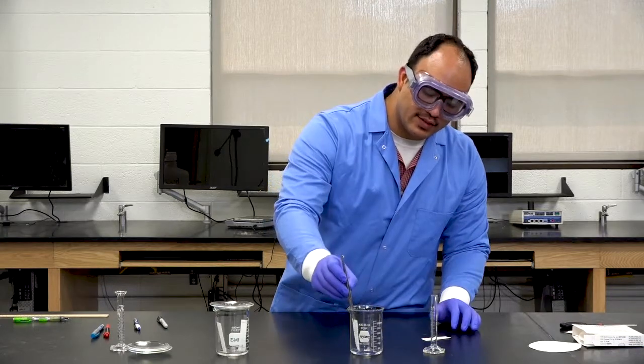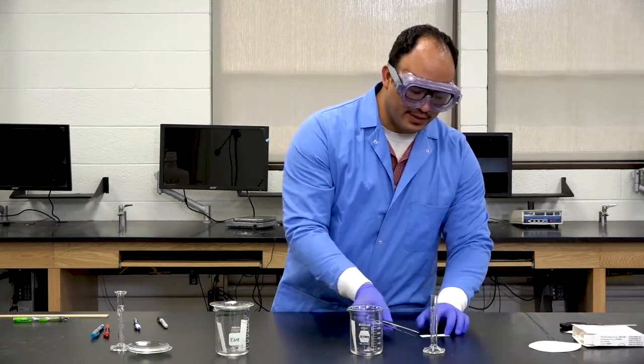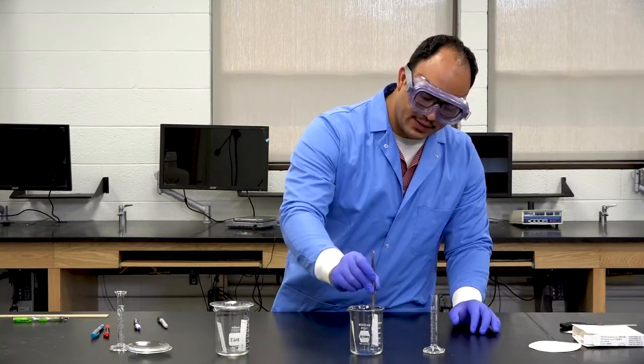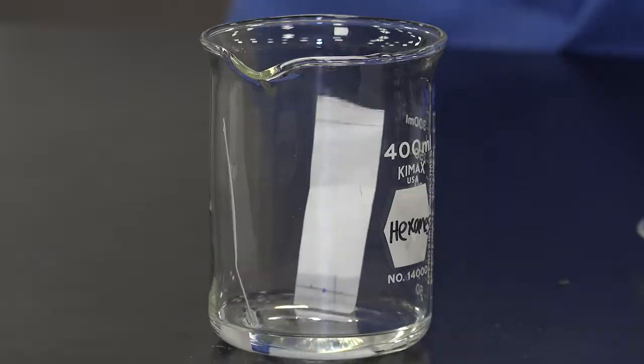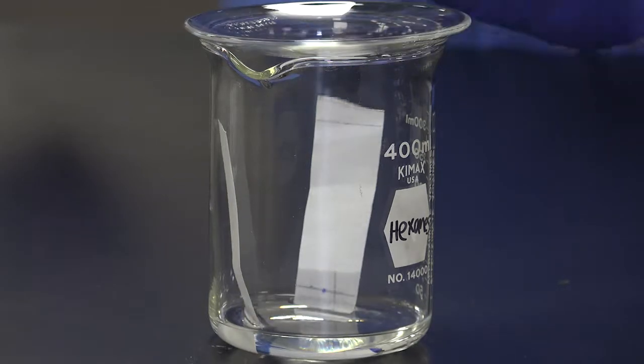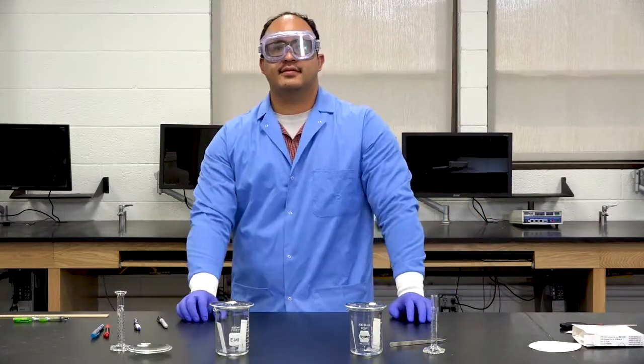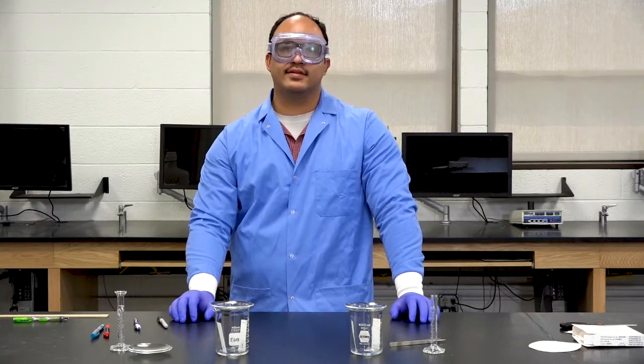And you want to make sure that the solvent level is below the bottom marking of the chromatography paper, because you don't want the sample to go into the solvent. You want the sample to travel on the paper through capillary action by the movement of the solvent molecule.